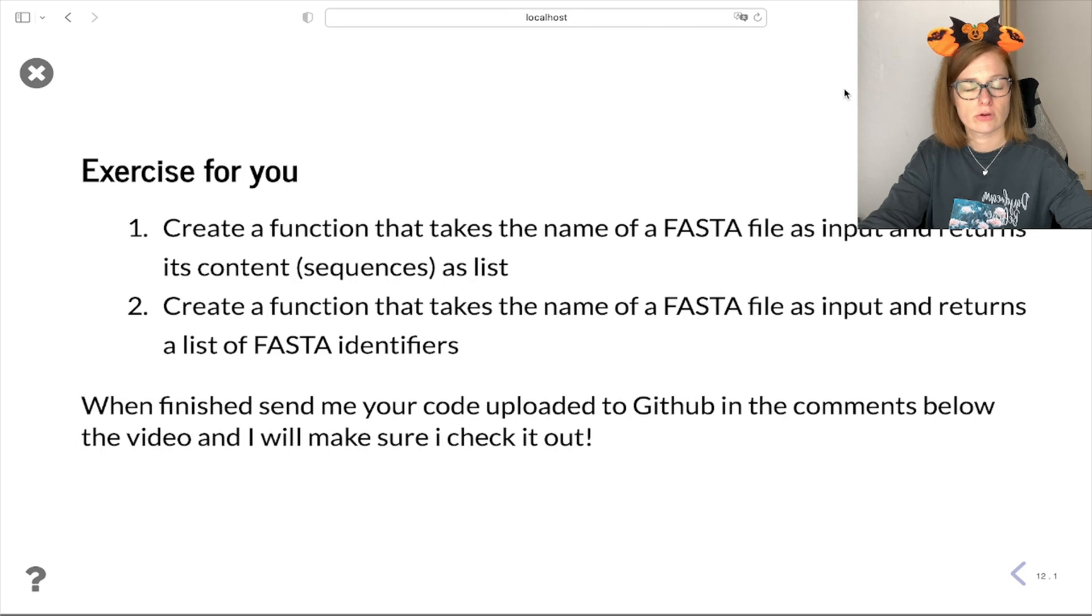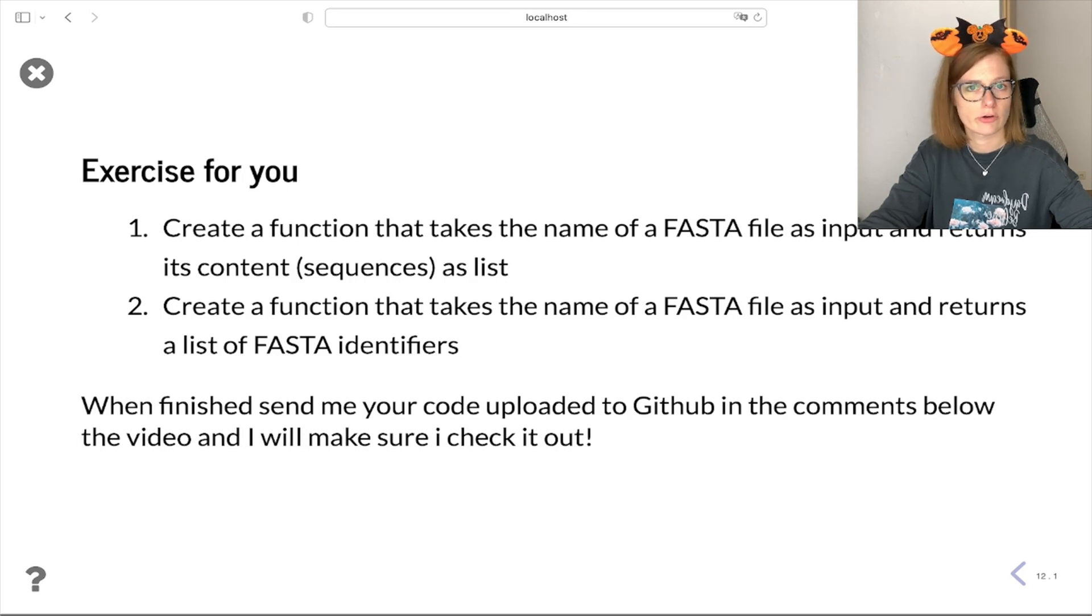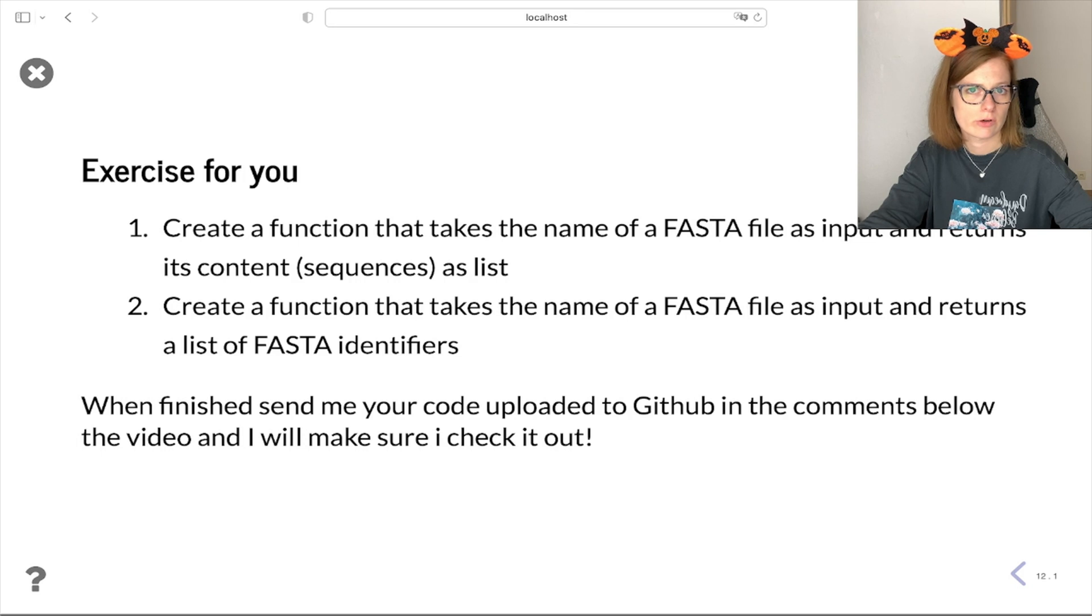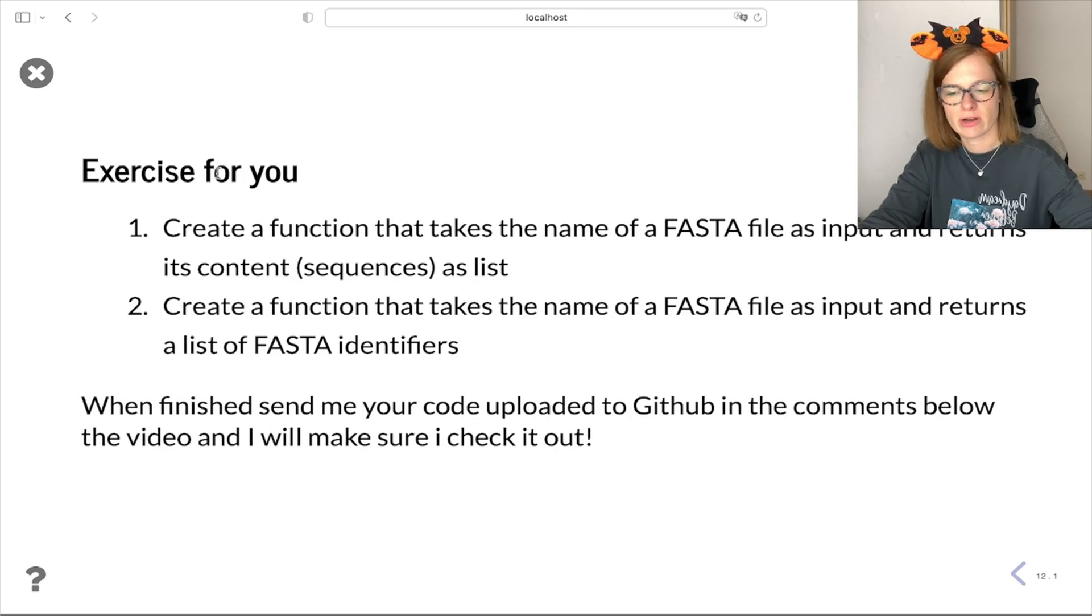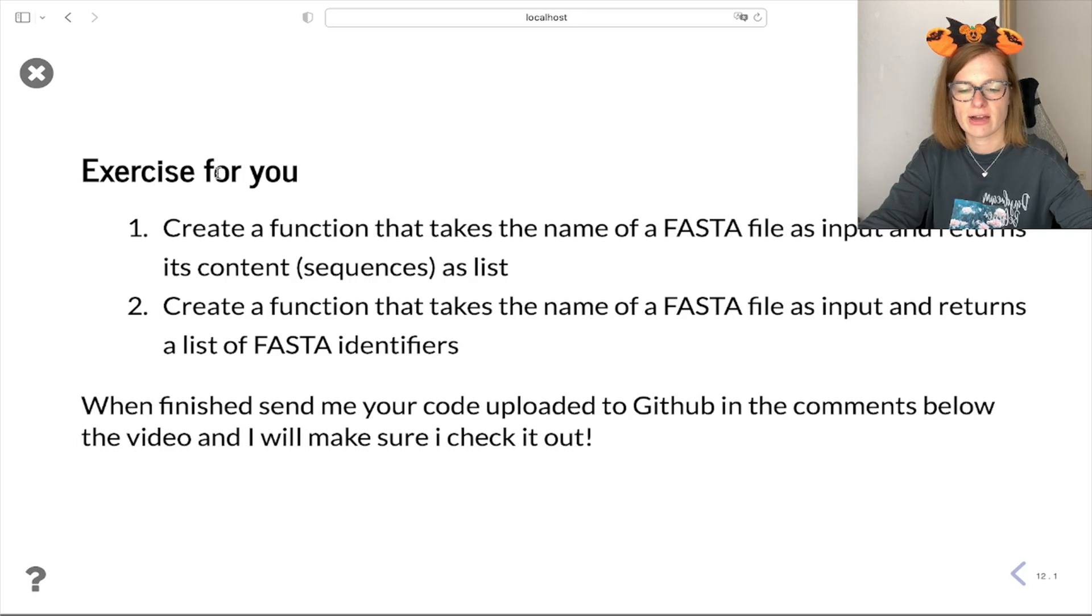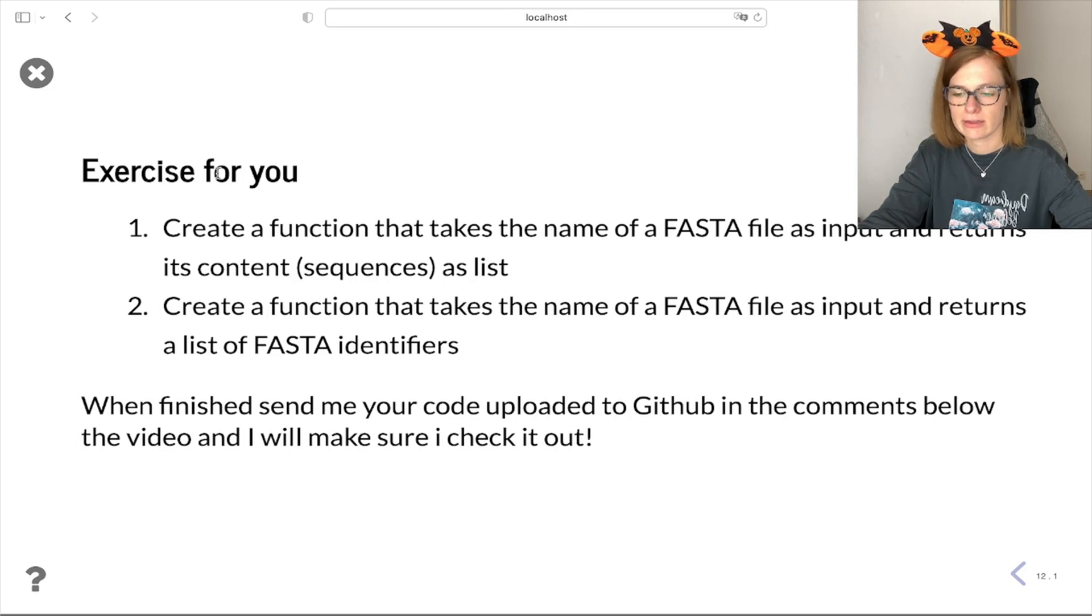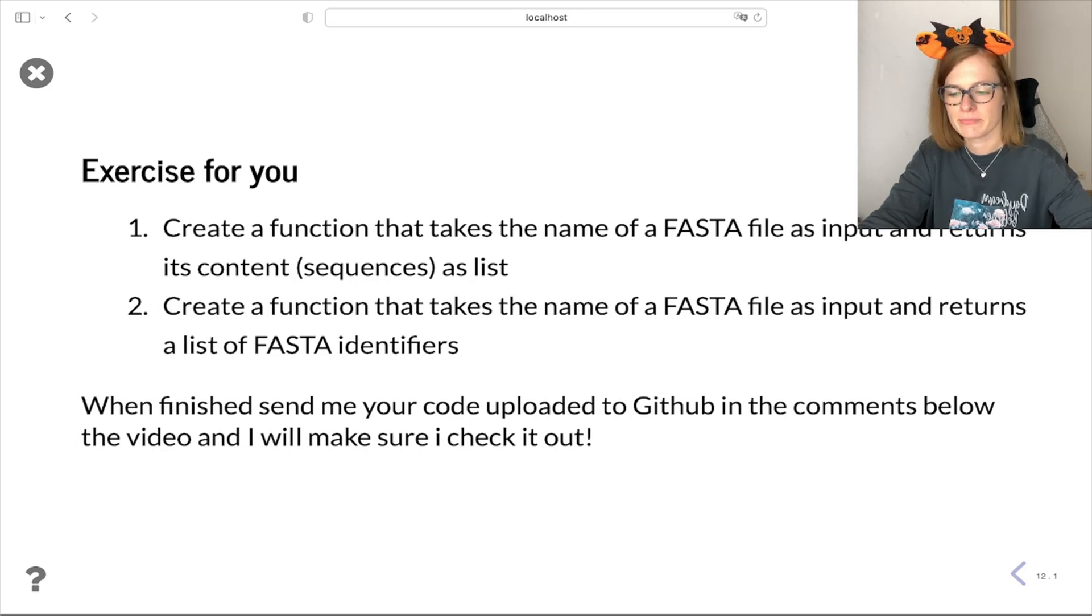And to conclude this session I prepared a little exercise for you for anyone who would like to work on their skills. So the first one is: create a function that takes the name of a FASTA file as input and returns its content sequences as a list.